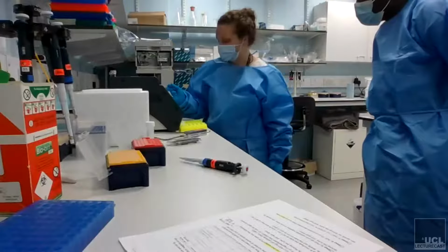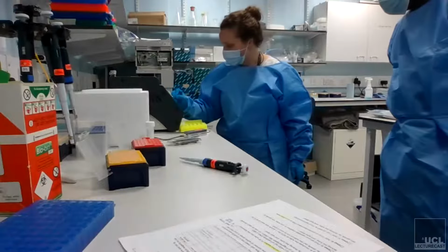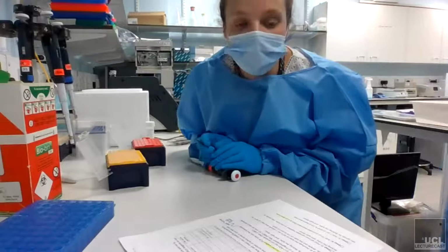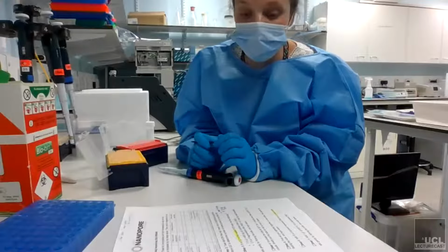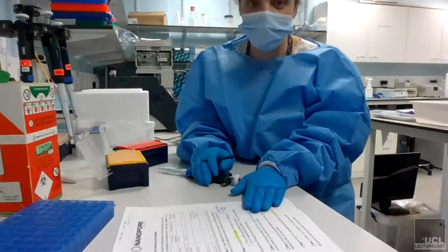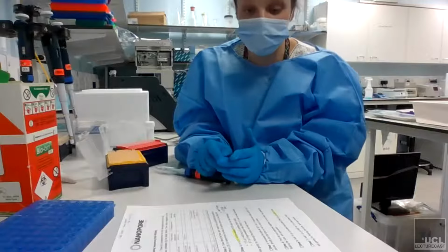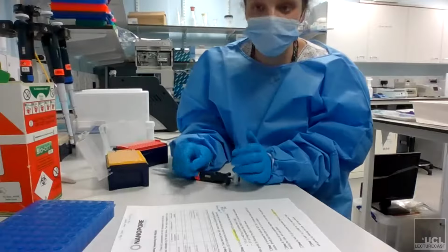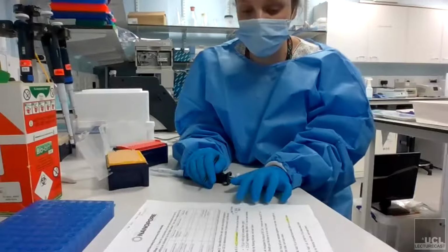Hi, Lindsay. Hello. I have just one question. I remember when we did the workshop, we used the magnetic beads. So why don't we use it here in this? That's a different protocol. So you're right that in some of the protocols you do use magnetic beads to select certain sizes of DNA. This is kind of a quick version of the protocol. So as long as you have the right amount and size and purity of DNA, you don't have to do any of those extra steps because you've already kind of confirmed that you have the right size and the right quantity of DNA. So this is just the easiest, quickest protocol that you can do.